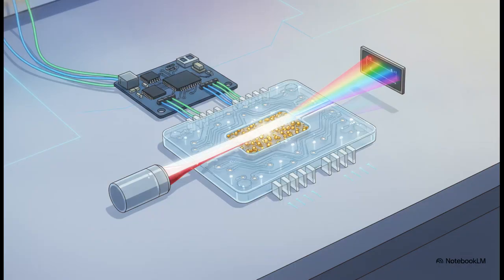And this is where Dr. Kem's complete experiment truly shines as a brilliant recent example of this evolution. They presented a novel, low-cost, microfluidic biosensor prototype that cleverly immobilizes a lipolytic enzyme onto an ethylene vinyl acetate polymer support. What's so fascinating is that it uses an Arduino-based spectrophotometric transducer and p-nitrophenol as an indicator to estimate the fatty acid release. And it does this effectively, detecting levels directly from 7.6 to over 58 milligrams per deciliter, all without even needing to dilute the sample.